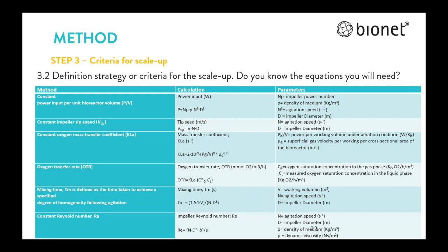For example, in bioreactors, adequate mixing is essential to ensure the adequate supply of nutrients and to prevent the accumulation of toxic metabolites. For a bioreactor designed for a suspension system, mixing time is a critical parameter to be studied and evaluated. The fluid hydrodynamics, fluid rheology, impeller type, power input, and vessel size can all influence the mixing conditions. For that reason, remember from step 2 of this webinar, the selection of the right raw material is very important, thinking big.